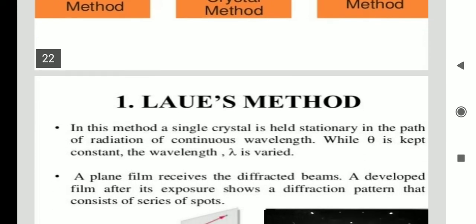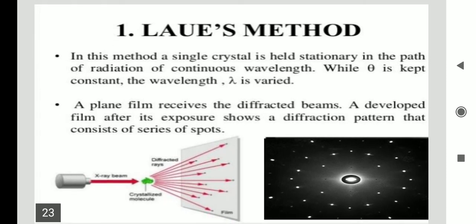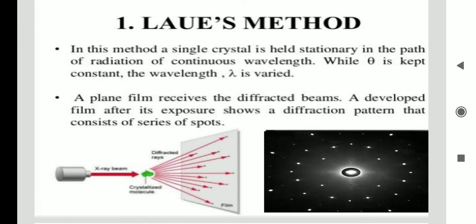Let's see what the Laue method is. In this method a single crystal is held stationary in the path of radiation of continuous wavelength.